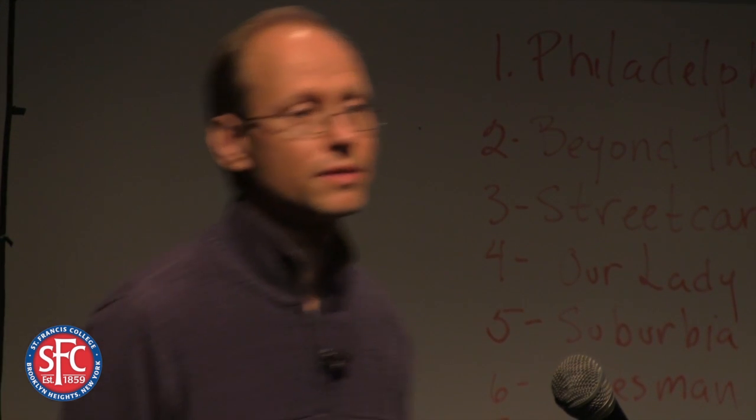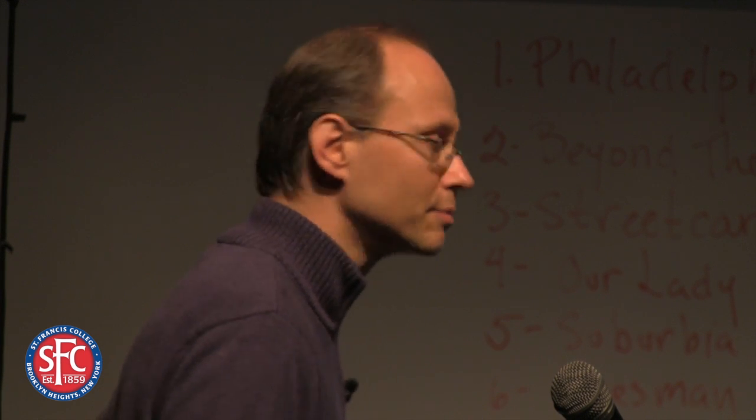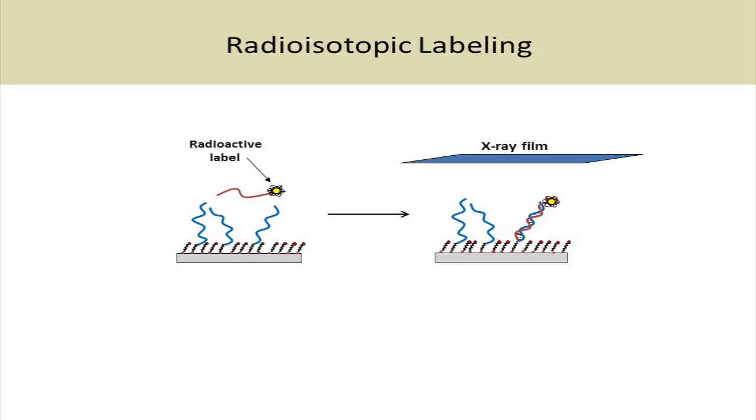Classically, radio labeling was used. I'm sure that's something you've also heard about already. This is hard to incorporate into a biosensor, and people don't really like to work with radioactive materials, so fluorescence has really displaced radio labeling these days to a large degree.